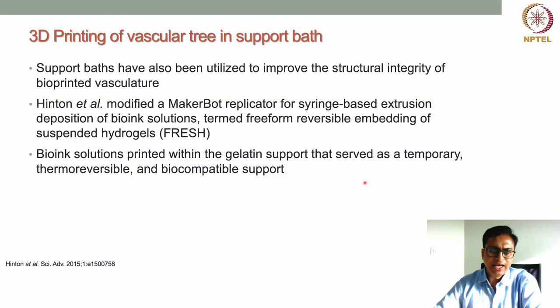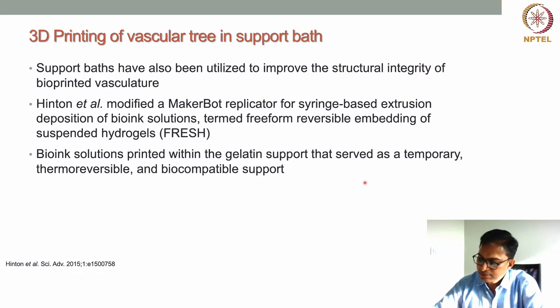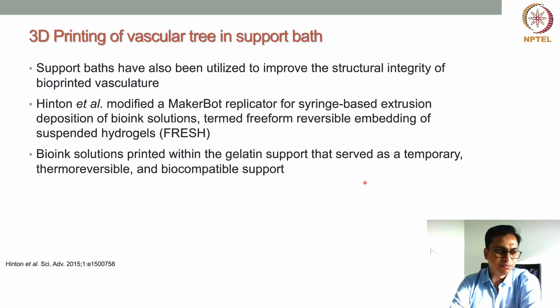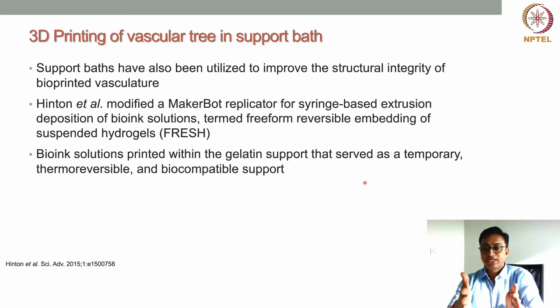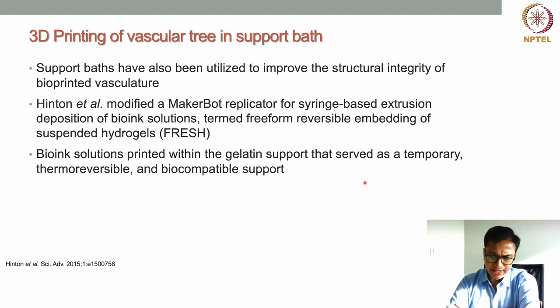One of the biggest challenges for direct printing of vascular constructs is that most of the time the vascular network or vascular structure is not self-supporting and tends to collapse. As already seen, spreading of the bottom layers happens due to gravity.